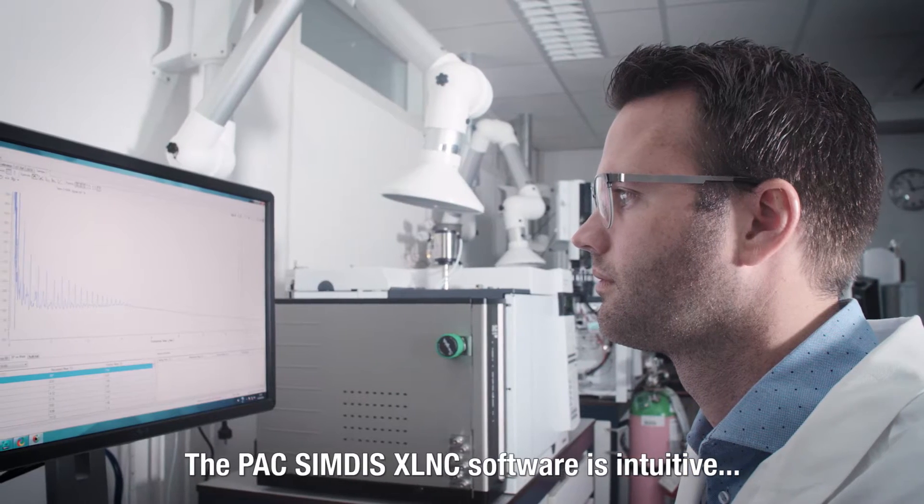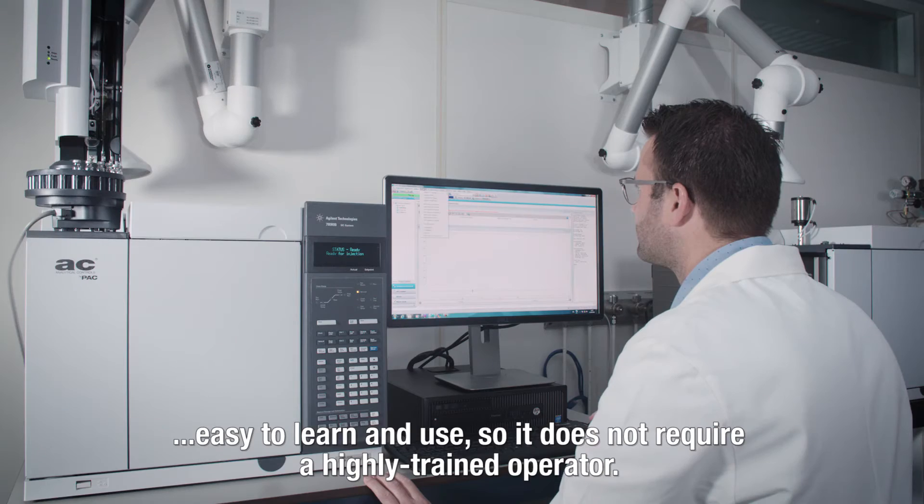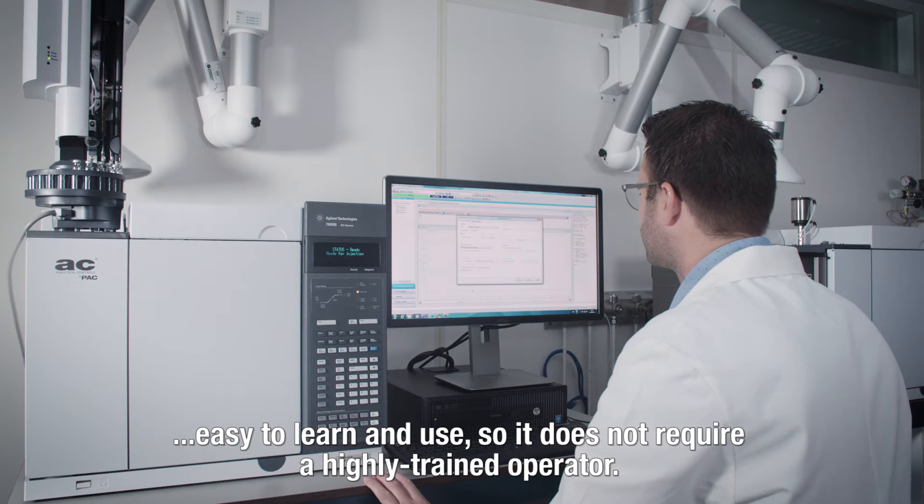The PAC SIMDIS Excellence software is intuitive, easy to learn and use, so it does not require a highly trained operator.